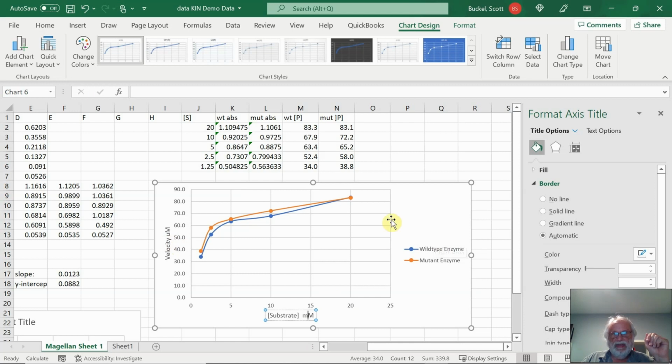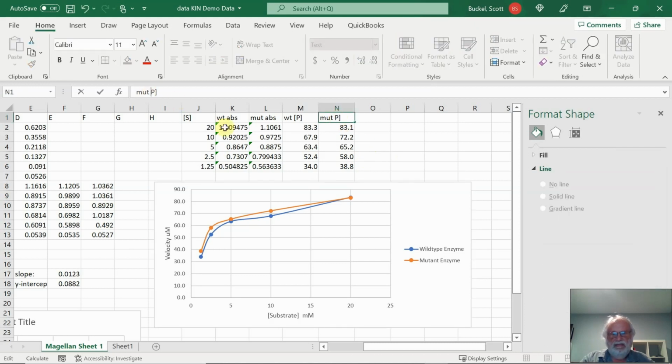So here we have a Michaelis-Menten plot. This is one of the things that I wanted you to put in your report. And so here you have it in your report, and you'll be able to talk about this a little bit. Now, to be able to determine the kinetic constants, you see this line here keeps going up. And so we don't really ever know what the Vmax is going to be here. I suspect maybe there's some kind of interesting kinetics here, but I'm not really sure what is happening here. But let's go ahead and do the Lineweaver-Burk plot.